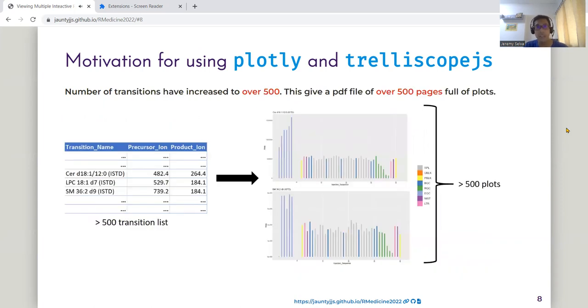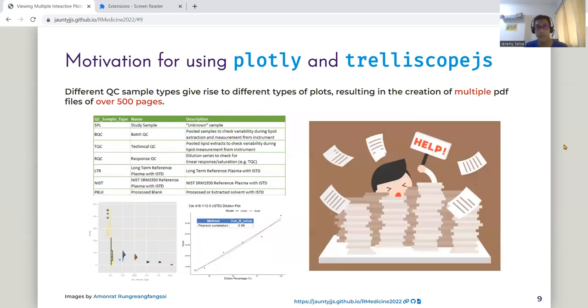In addition, the number of transitions have increased to over 500. This gives a PDF file of over 500 pages full of plots. Lastly, to improve the quality of our data, we have different QC sample types as well. And this gives rise to new plots such as the rain cloud plot and the dilution series plot.